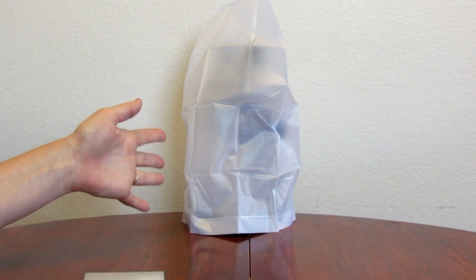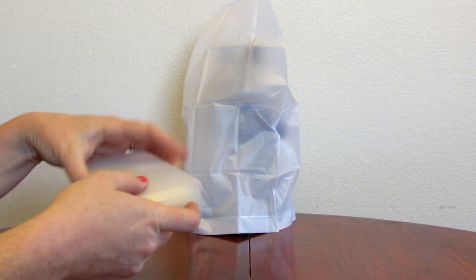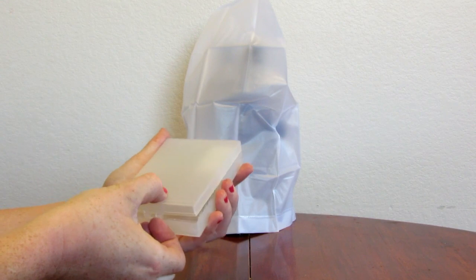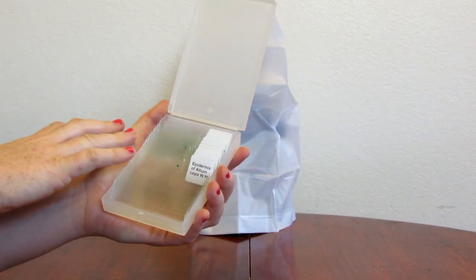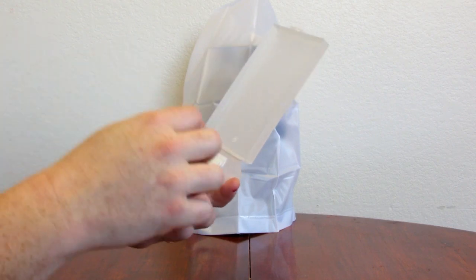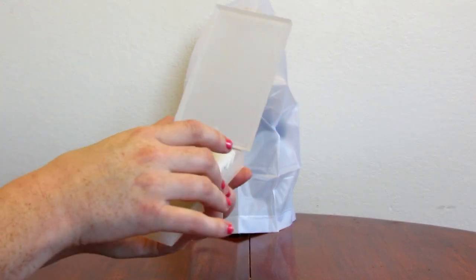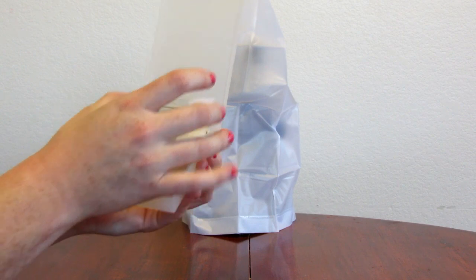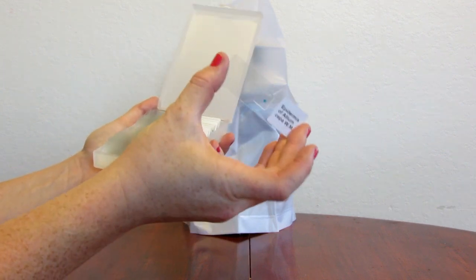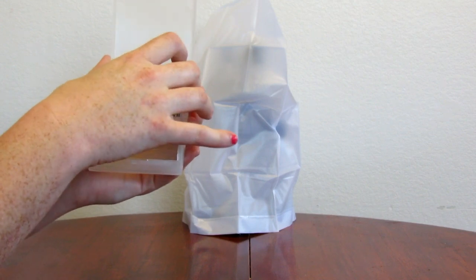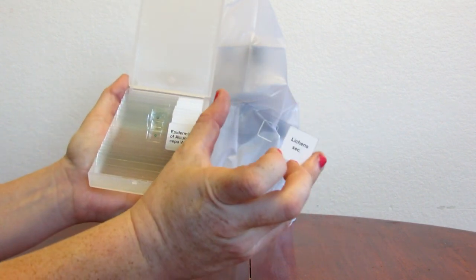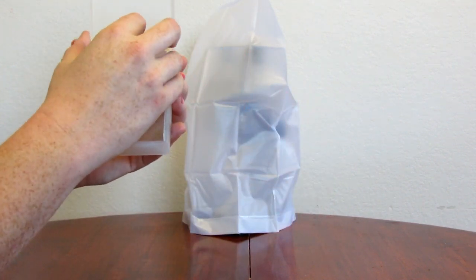The microscope does come with a dust cover. You also have your slide case. It has extra slides, but it also has slides already prepared with a specimen, such as the epidermis of allium sepa, which is an onion skin. You have fungus, pollen.